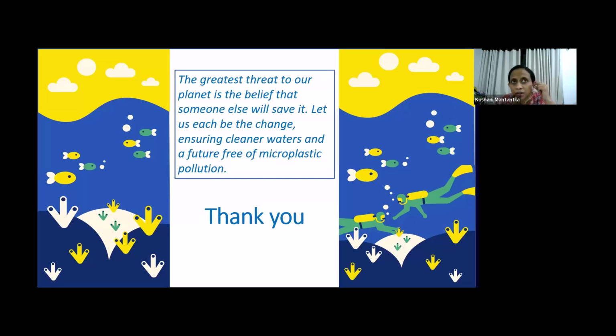I have seen in 1 or 2 papers that they have used the UV spectroscopy also for the microplastic analysis, but the basics, even I too have to go through it.